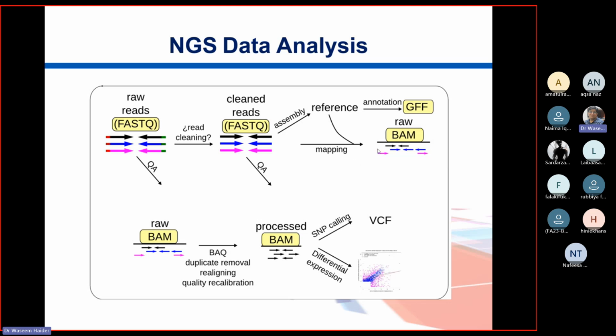And here on this picture, you see there is that thick line. That thick line represents your reference, while these individual arrows are your reads which are aligning to the reference, right? You just count them, or you can compare them, like what you have here versus what you have here. In that case, you are doing SNP calling.